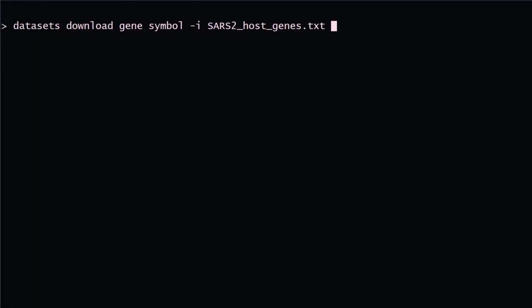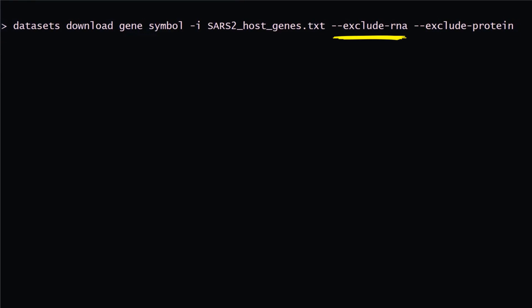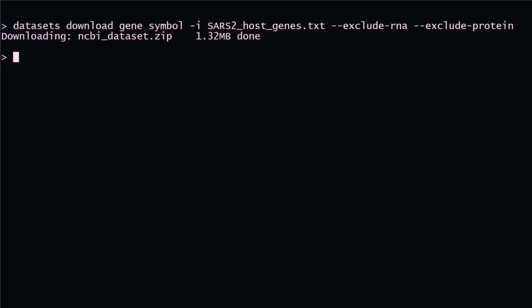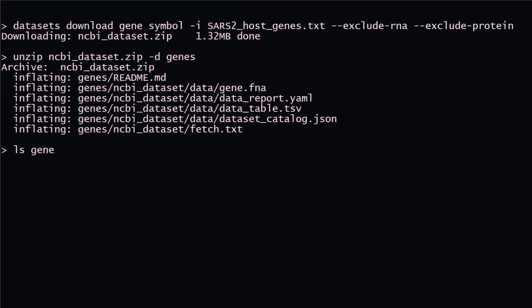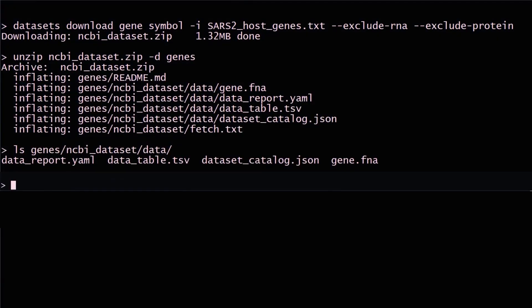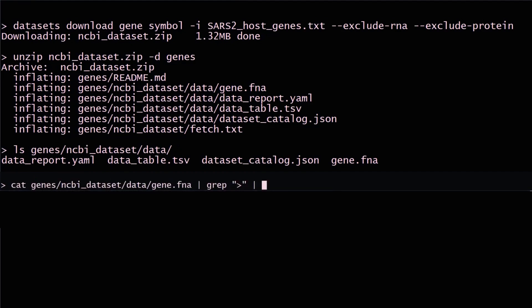The default download includes all available sequence files. If you want to filter your download package to a particular sequence type, or maybe you just want the metadata, we provide flags to exclude specific file types. In this example, we're excluding the transcript and protein files, retrieving just the gene FASTA sequence and the metadata. You can also use basic UNIX tools to print the FASTA headers for gene sequence, for example.